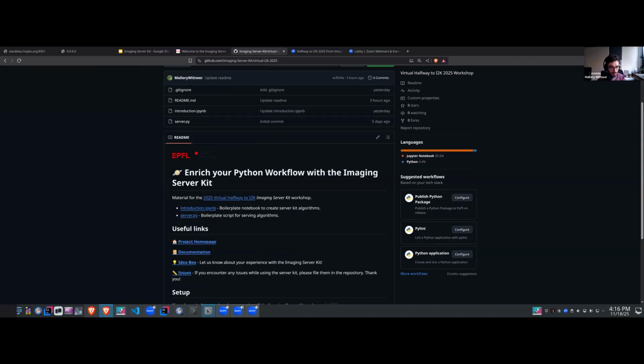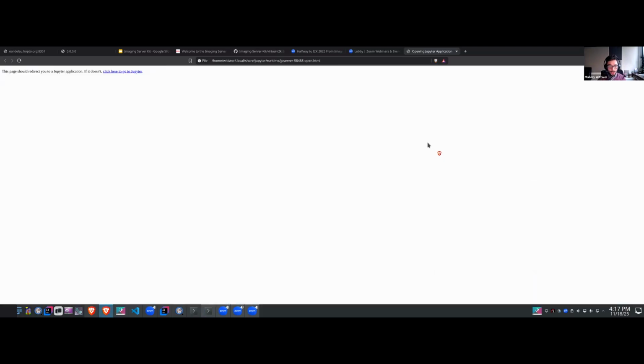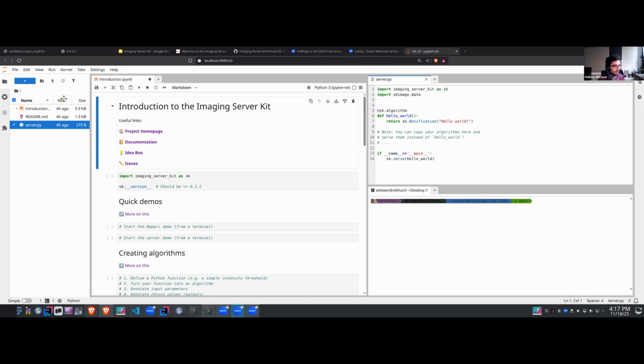Okay, so for my part, I will just pop in this little terminal here, and I will start a Jupyter Lab session. So you see, I've already cloned this repository in here. So I will just start a Jupyter Lab session in here. Okay, and I will put this over here.